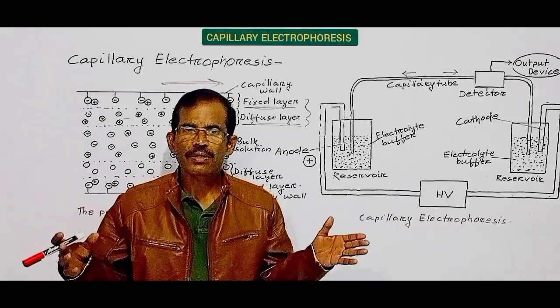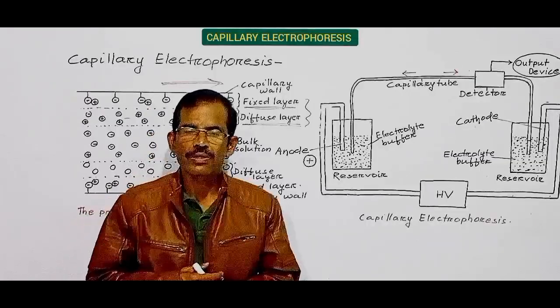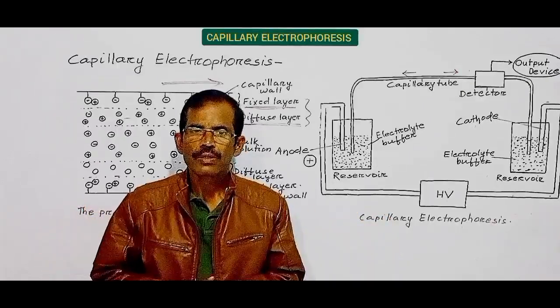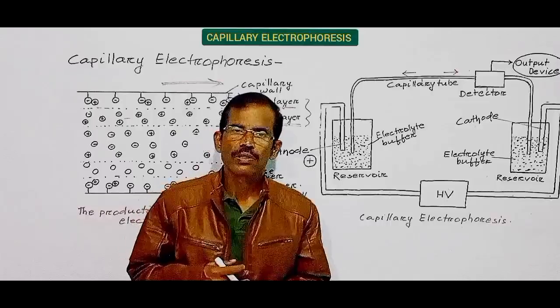Other applications are identification of point mutations in DNA and separation of chiral compounds. Friends, this is all about capillary electrophoresis.